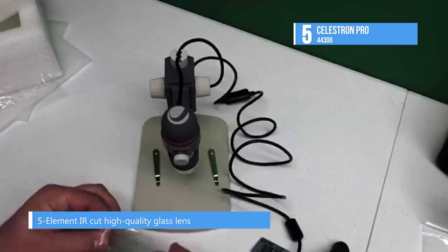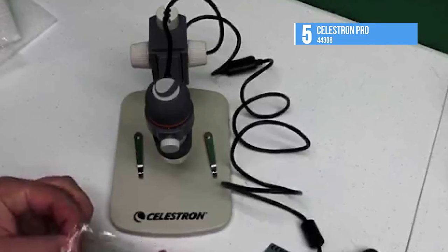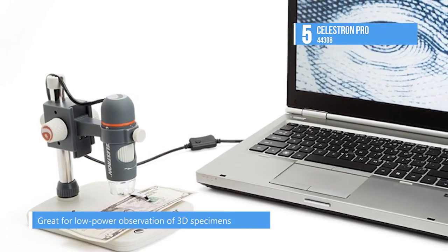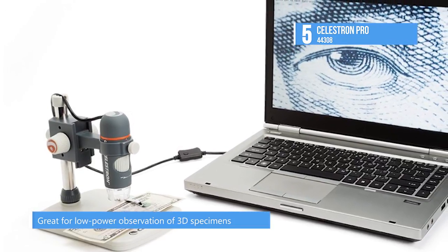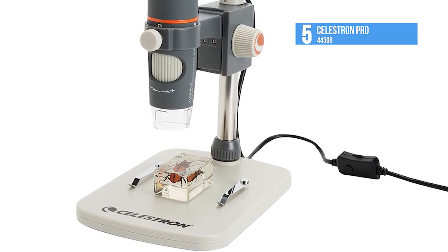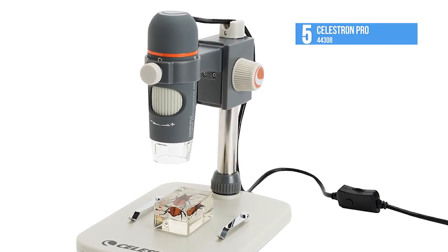With its 5.0 megapixel imaging sensor capable of capturing still images and videos, infrared-reducing five-element glass lens, and an 8 LED illumination ring, you capture bright and crisp high-resolution images and 30 frame-per-second videos. Optimized for 3D examination of larger objects, this kit can also be used to study miniature artifacts by bumping up the magnification power, which can be increased up to 800 times depending on monitor size.